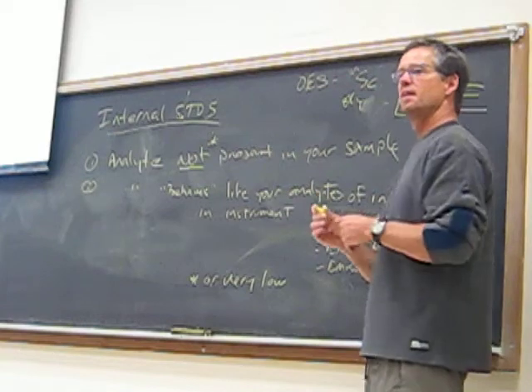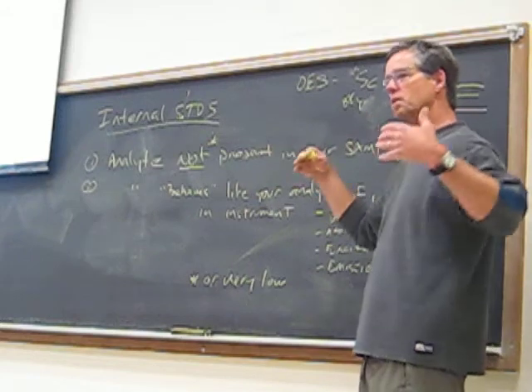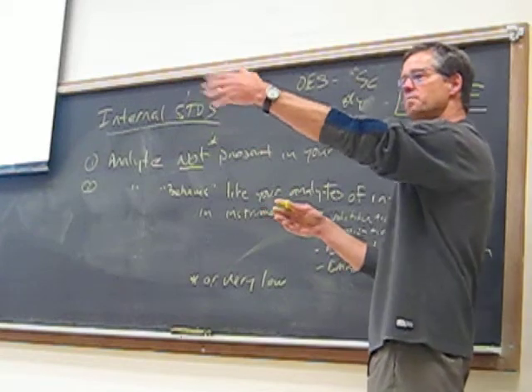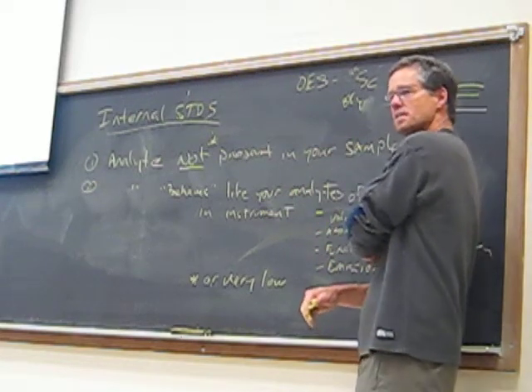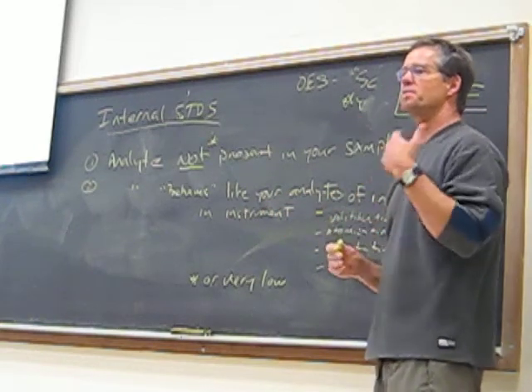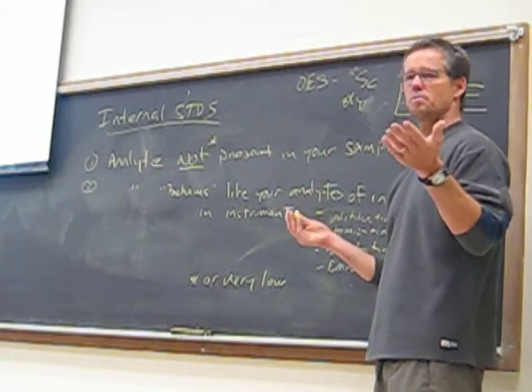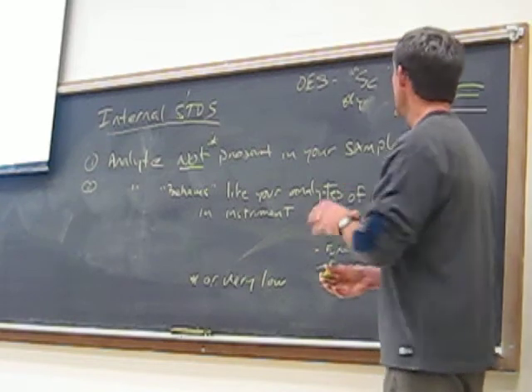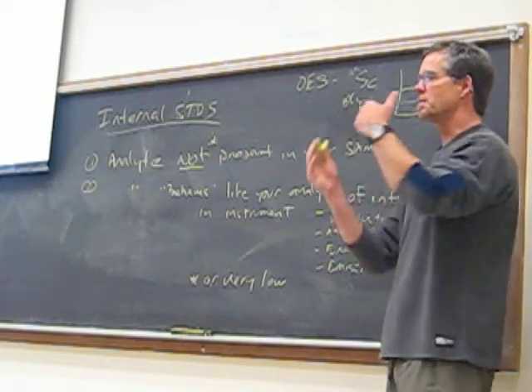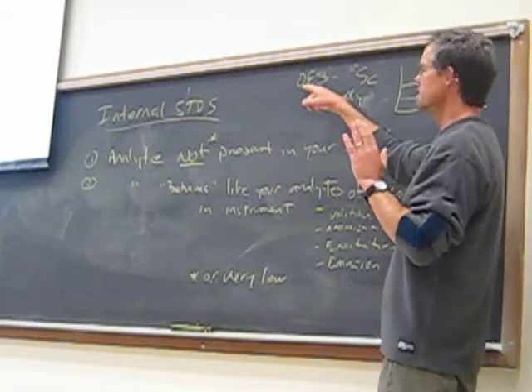And it allows me then to just normalize computationally all the signal I get from my analyte to what's in there, and I can, in principle, correct for all these problems of pump noise, delivery, differences in delivery rate because some samples may be more viscous than others that get pumped and introduced into the plasma, and excitation and ionization process. It allows me to automatically, the instrument does it for me, correct for all that. And it's so much more effective and time efficient than some of these other approaches that we would otherwise have to do, like method of additions or something like that. And so all ICP kinds of instruments, whether it be OES or mass spectrometry, and even molecular mass spectrometry, most of them now rely on some technology that utilizes an internal standard approach.